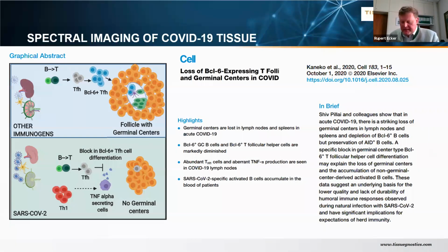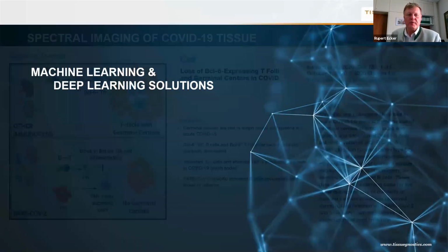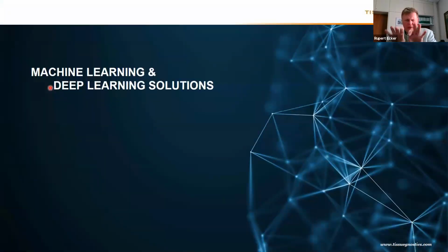In the latest version 7, which I mentioned at the very beginning, that also supports the OME, open microscopy environment image types, we also have an extended machine learning module and a new algorithm for nuclear segmentation, especially in such lymphatic tissues, which tend to be very, very dense, with very high cell density.